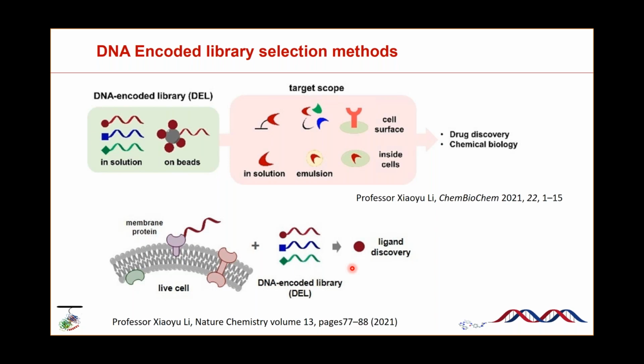So I think this difference is very important to see. And another thing we struggle with is that sometimes you will have some interference. This interference may come from your protein not being quite pure, and although you see the features, actually that's not your desired protein. It may bind with something else, and sometimes you just don't know. Although the data is quite clear and suggests you do have the binder, the binder is not what you want.